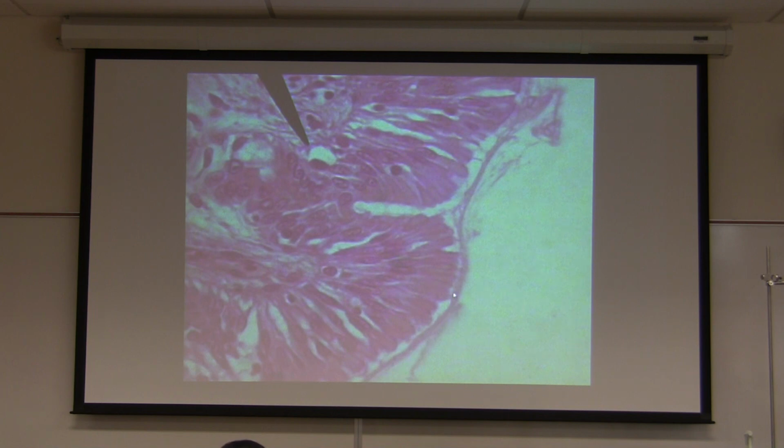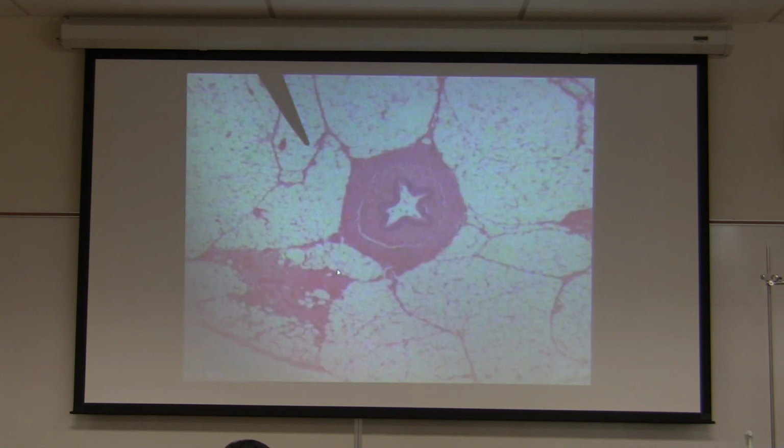Right here, high magnification, right? Beautiful cilia. And these are columnar cells. Underneath, they are not columnar cells. They look like cuboidal cells, but you call it by what is on top. Remember that? So this is ciliated, stratified, columnar epithelial tissue. Okay, what is the name of tissue?